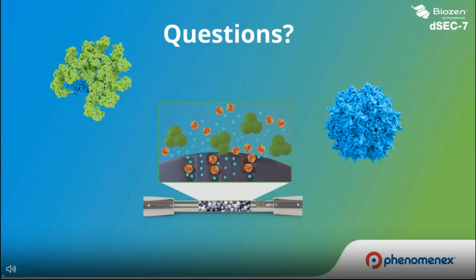Excellent. We have another question. They're asking if we have any tips and tricks to improve the sample preparation. With regards to AAVs, in my experience, these are actually very sturdy biologics. Typically, I found them to be quite more robust than some of the proteins that I've worked with in the past. When I get them, sometimes if they are frozen, I would thaw them. Most of them, I don't think there are any aggregates or anything that would clog my LC system. In some cases where I'm really looking to see what's in there, and I don't want to centrifuge and cause things to precipitate out, or apply a 0.2 micron filter and get things stuck in the filter, I would just try to inject straight, at least a small volume of it, and monitor the pressure on the LC system. If it doesn't clog, then go ahead.